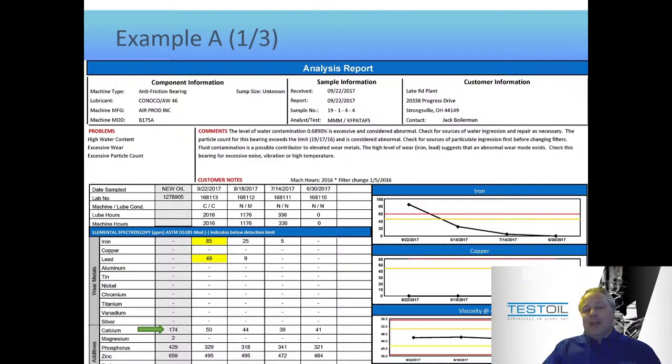So given that it's a flat trend, I don't think there's much of a concern about the calcium value. But like I said, it's good that we looked at it and said, I don't know if it's normal or not normal. But just because it doesn't compare to the new oil value doesn't mean it's not normal when the trend is flat the whole way along.